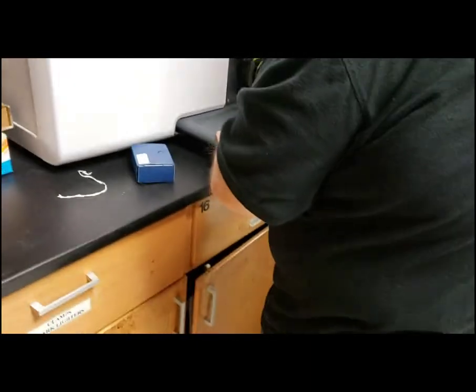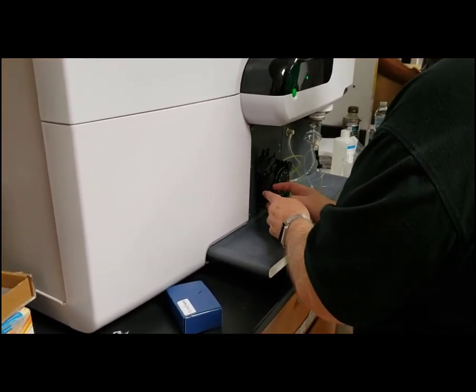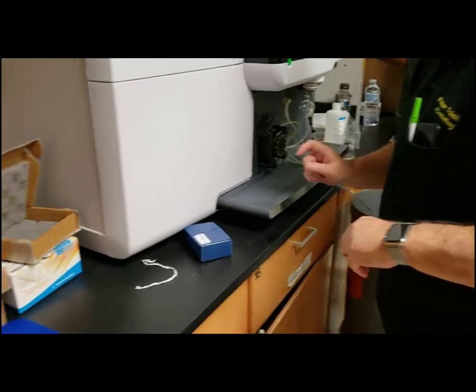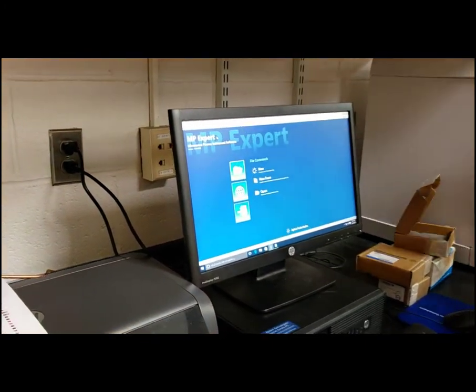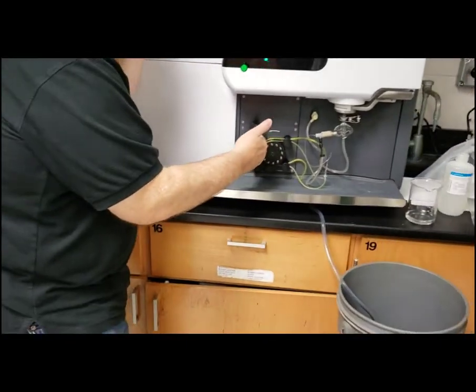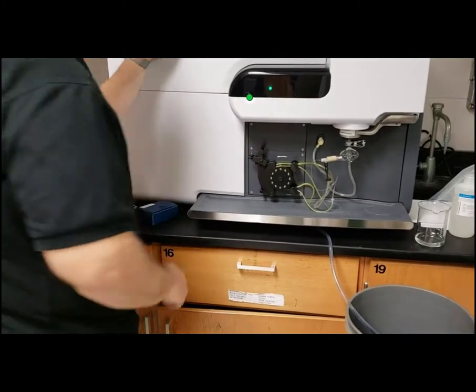Okay. So now these could be off center, and if you feel inside here, we want them in the middle. We don't want them on the edge. The edges are sharp, and you could damage them. So how we make sure that those are centered is we come over to the software, and where it says pump, go fast pump. This will make the pump go 80 RPM, and you saw how they self-align. They went from the edges to the middle, so this way we know we're aligned, and then we just put the pressure plate on while it's going. And then we just turn it off.